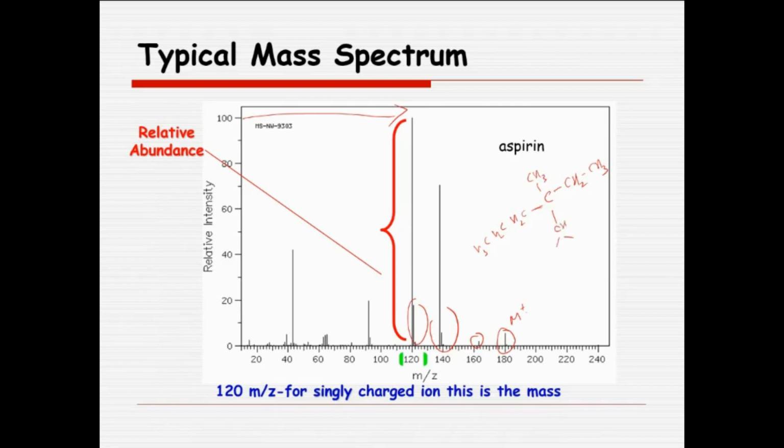Okay, so this is a molecule. First, it will form the molecular ion. And in this, the most favorable fragmentation will be this CH3 going out. This going out. Okay, the longest carbon chain will go out. So generally, when you take an alkyl system and you have a tertiary carbon or branched carbon, the longest alkyl chain will go out first.